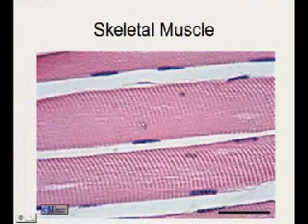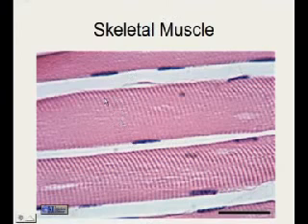This slide illustrates skeletal muscles. Look at the longitudinal pattern that exists here. Also look at the pattern of striations, the peripherally lying nuclei. This pattern is very consistent with skeletal muscle.